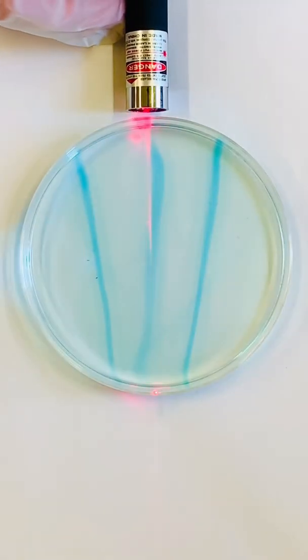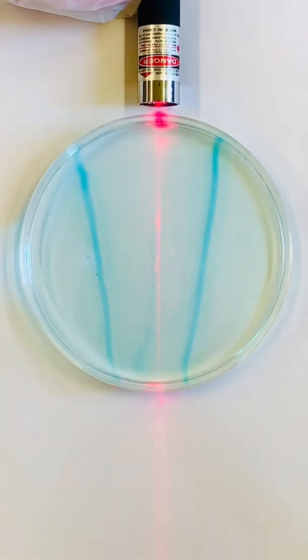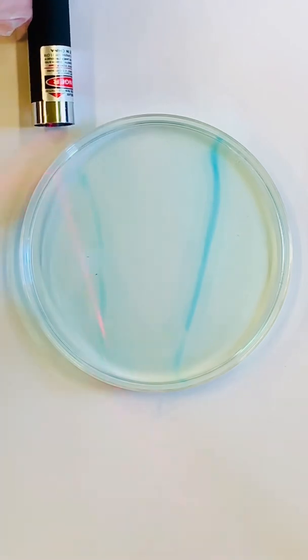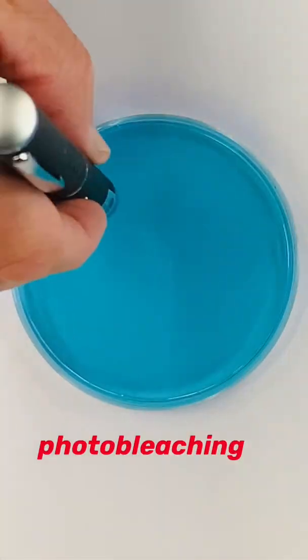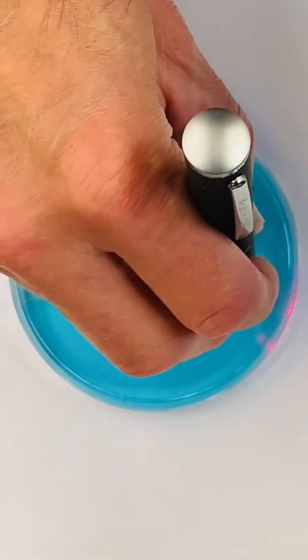Now check out what happens if we shine a red laser through the blue dye that's been formed. Hey, it's acting like an eraser. In this case, the red laser is causing the blue dye to undergo a process known as photobleaching. The photobleaching effect can be used to draw some pretty interesting designs in a solution of methylene blue.